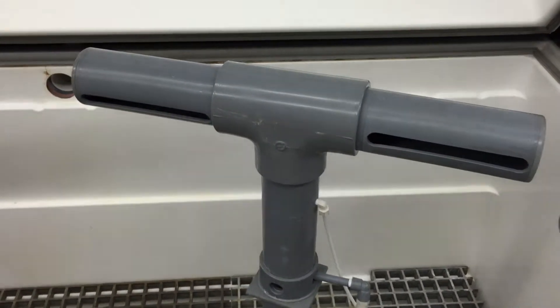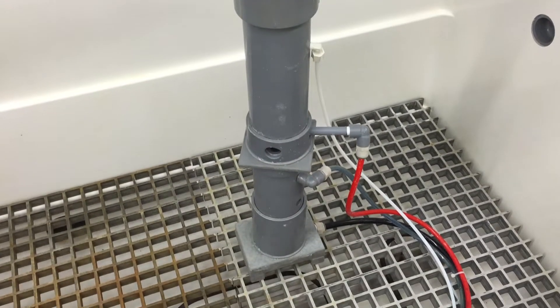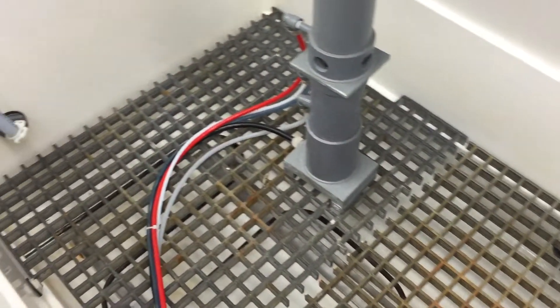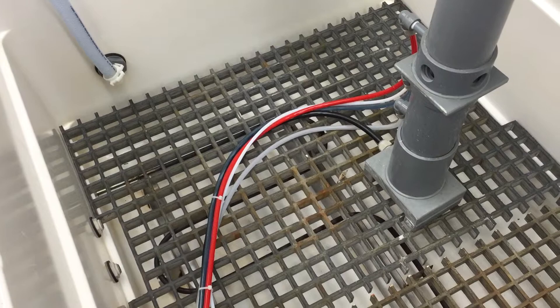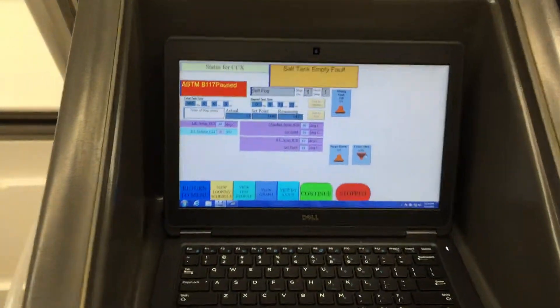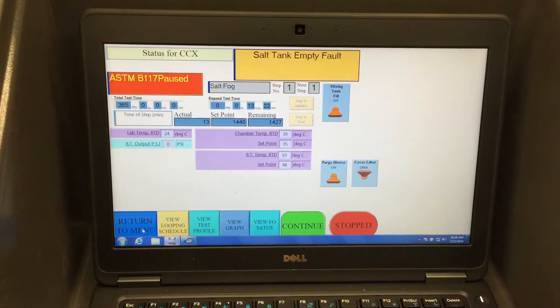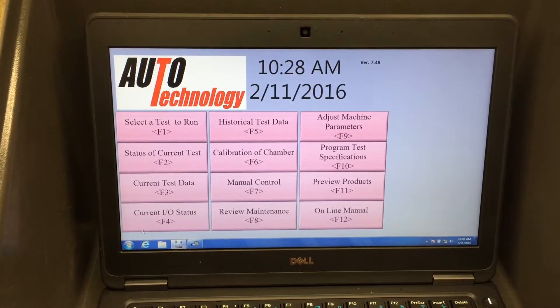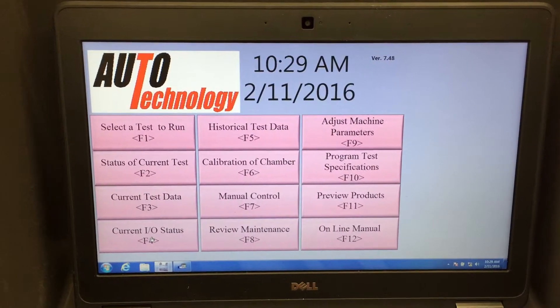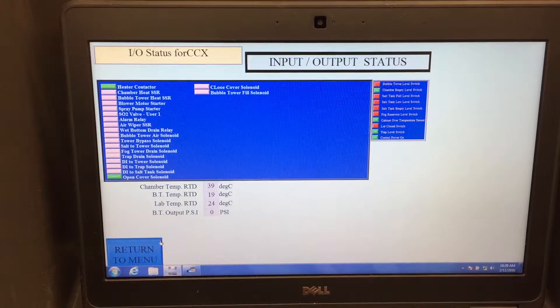Two fog towers inside the chamber. There's the main menu and there are multiple other menus you can go to, including all the IOs showing what's currently on.